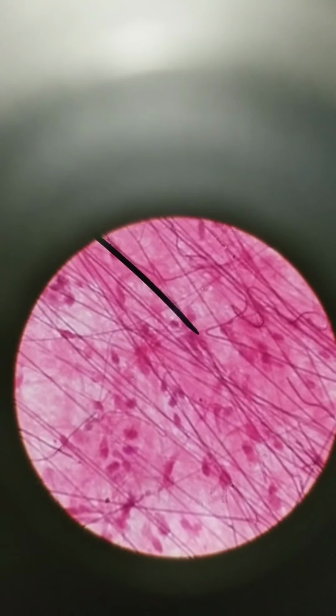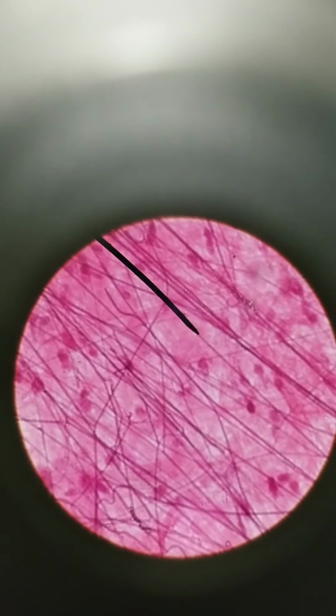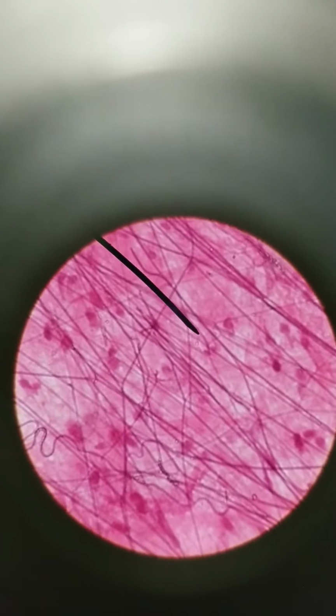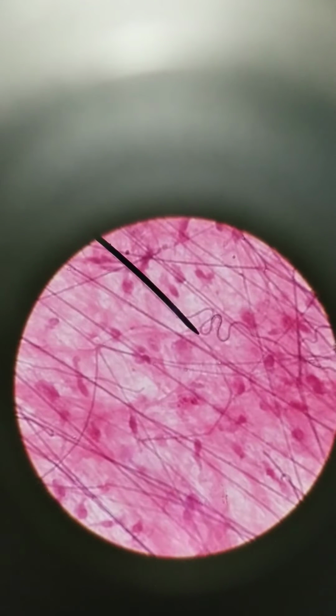I think this is the best we're going to get over here. Dark branched ones are reticular fibers. The faded background ones, those are collagen. Dark branched are reticular. Wavy are elastic fibers. This is areolar. It's found deep to the epidermis. It's found deep to pretty much every other type of membrane: mucous membrane, synovial, and serous membranes.